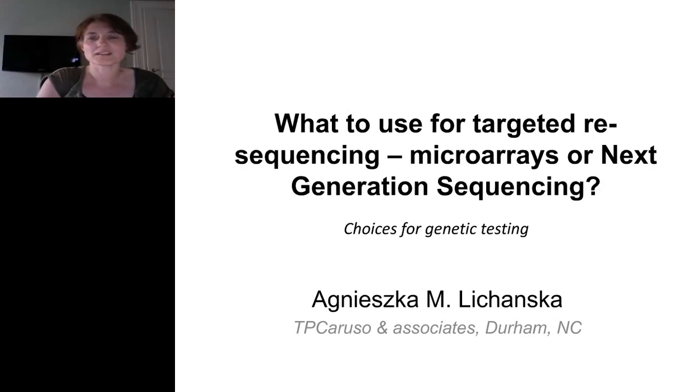I would like to thank the organizers for giving me this opportunity to talk to you today about choices for genetic testing, in particular about using targeted resequencing. And I'll focus on two platforms, microarray and next-generation sequencing.